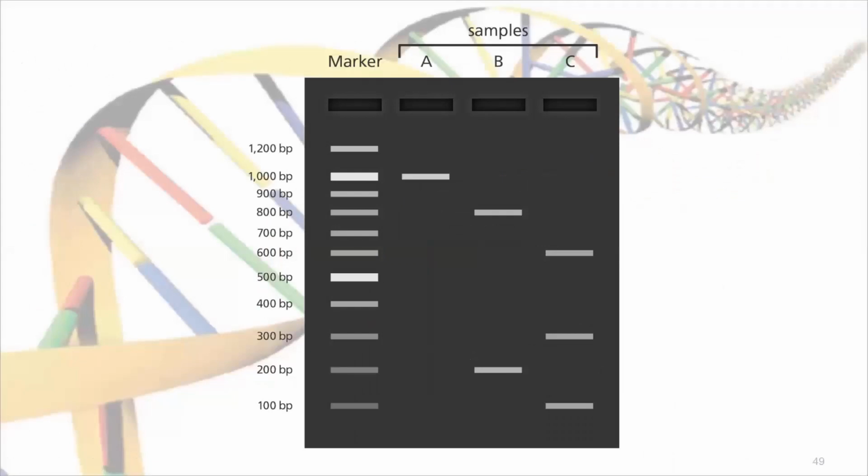Now see here, let us say, for example, A and B, you leave it. Let us say C, in this well, you have pushed your DNA mixture. The DNA which was cut to get 3 fragment sizes, out of which 1 fragment is your gene of interest.